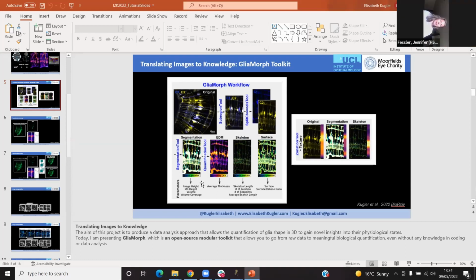Not quite. Actually, it's more of a technical question. Sorry, I have to open each different macro for each different step I want to perform and run that macro specifically? Yes. Okay, that answers my question. Yes, because I find it easier if people just do one step at a time and then look at their data and see, has it worked, has it not worked, are there any problems, and then work to the next step. Because when I had multiple steps in one go, people were just confused and tried too many things at once. Okay, I understand.